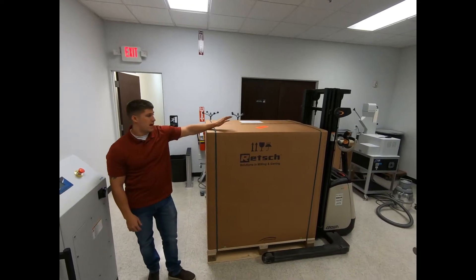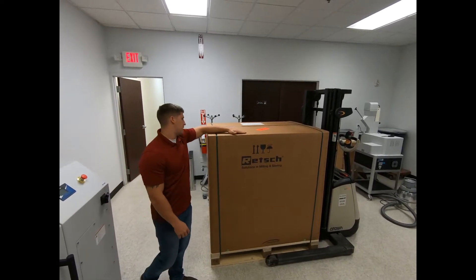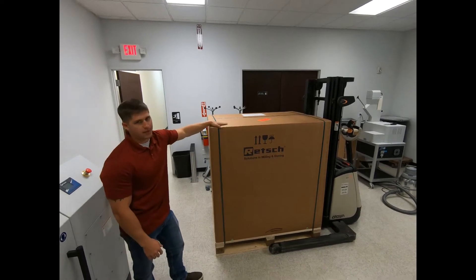Today I'm going to be explaining how to unbox your brand new RS200 unit. This is exactly how it's going to look when it shows up at your location, all boxed up.